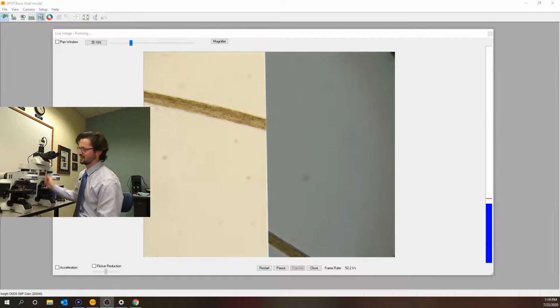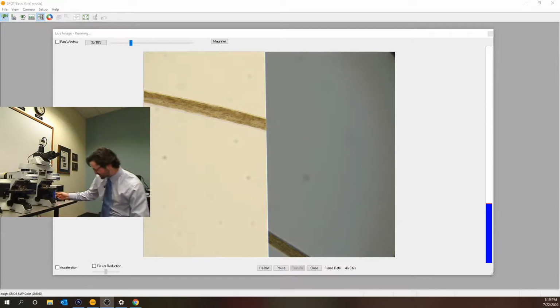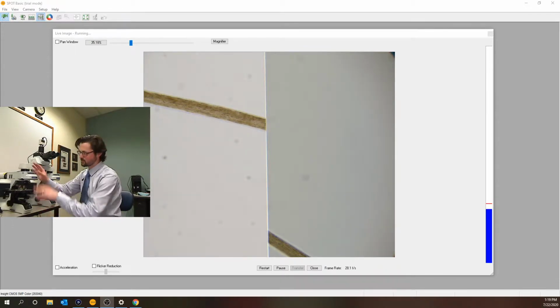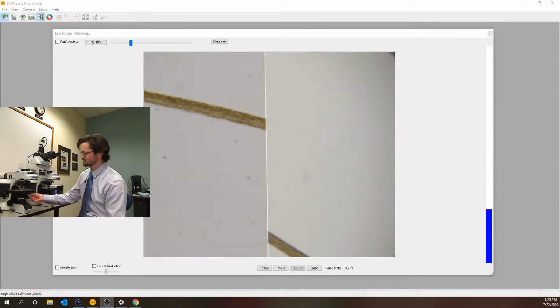So I've messed around with it, but let's see if we can get it side by side. Yeah, so obviously with this condenser, I changed something and we're on a different setting. So yeah, you can get them side by side, and then you're going to have that even intensity, even color balance on both sides of the microscope. There's a little bit of work. As you can see, it's not perfectly balanced, and that's largely because of slight differences in our aperture diaphragm and where they're dialed to. That's the basics of it.